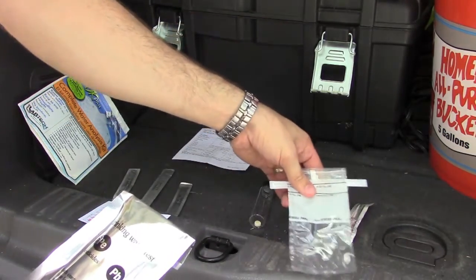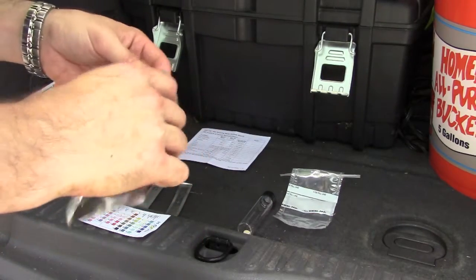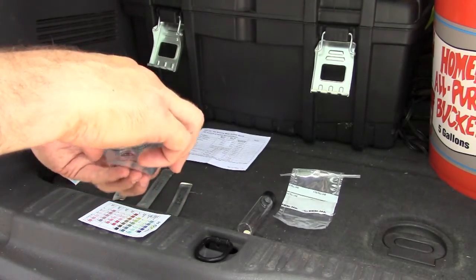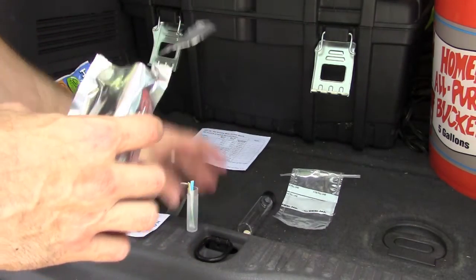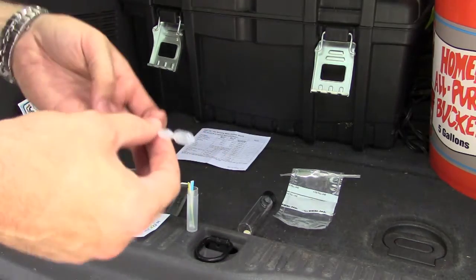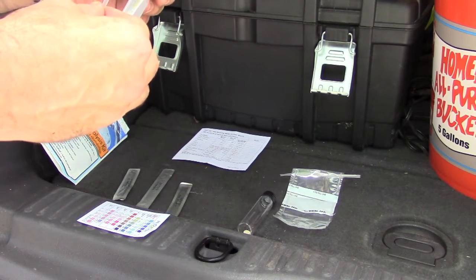I'm not going to drink this water until I do the more serious tests — the lead, pesticide, and bacteria tests. Opening up the foil pouch for the lead and pesticide test. We've got a little dropper, silica gel, and two strips inside.